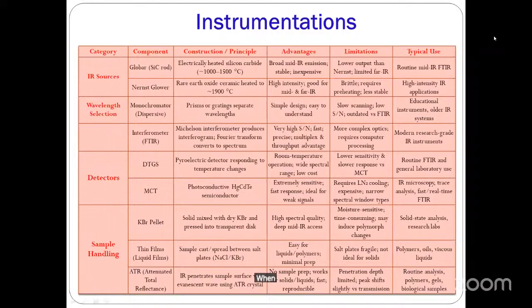When we talk about the sample handling, there are basically three types. The KBr pellet method, which is an outdated method. The advanced and modern sample handling method is ATR.